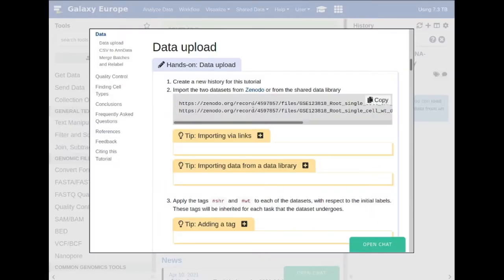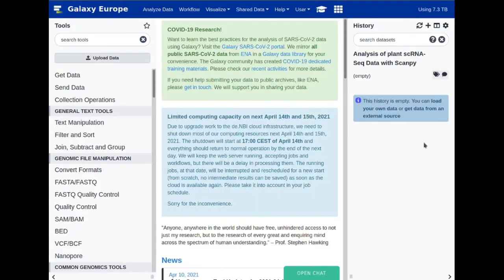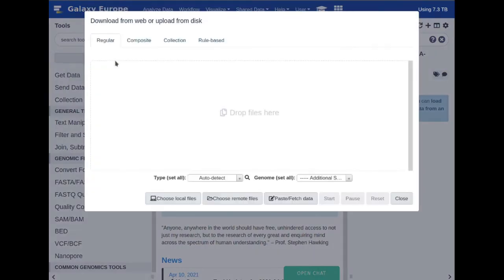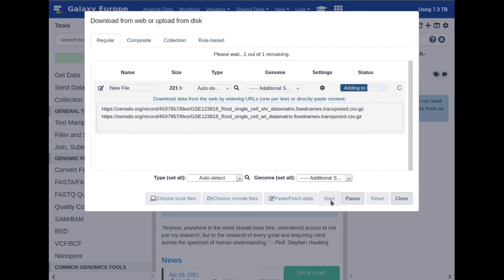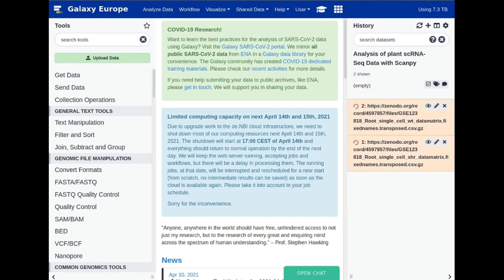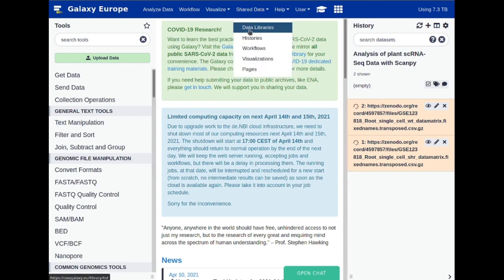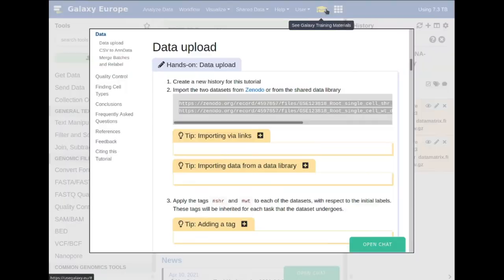Let's go back to Galaxy and simply copy the text in this file window, then go back to our history, click on 'Upload Data', paste into 'Fetch Data', paste the links we have copied, and click 'Start'. We can close that and once these start to go orange we can begin working on the next step. If you're doing a live session with us, it might be quicker to use the shared data from the data libraries, but you should use these Zenodo links if you're doing this at home.